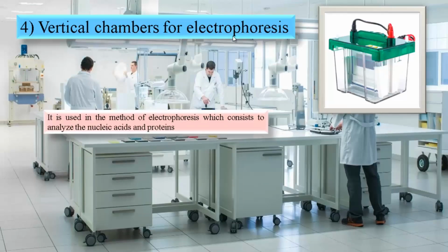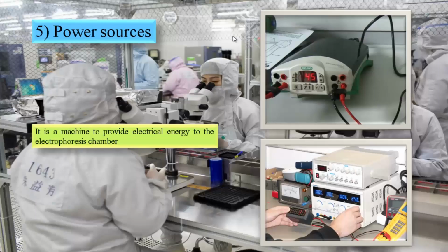Fourth, here we have vertical chambers for electrophoresis. It is used in the method of electrophoresis, which consists of analyzing nucleic acids and proteins. Fifth, we have power sources. It's a machine to provide electrical energy to the electrophoresis chamber.